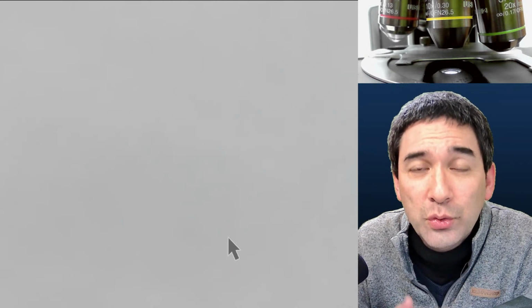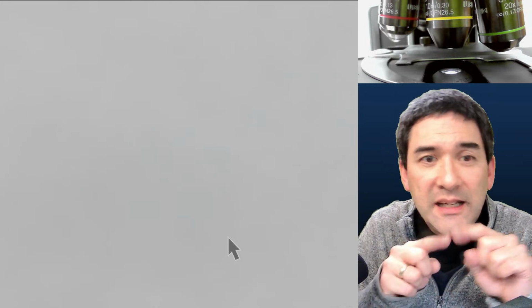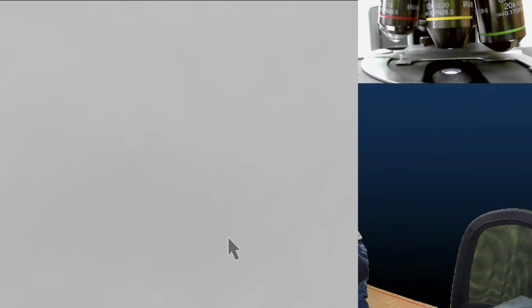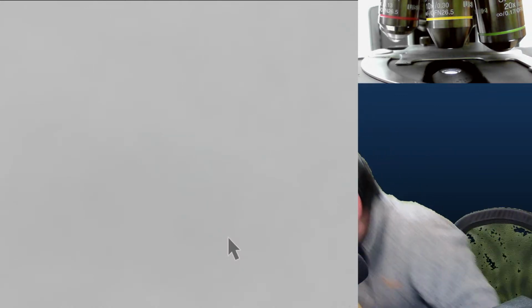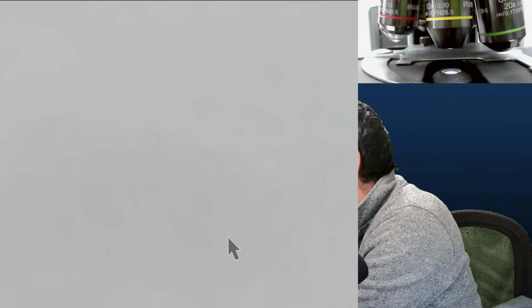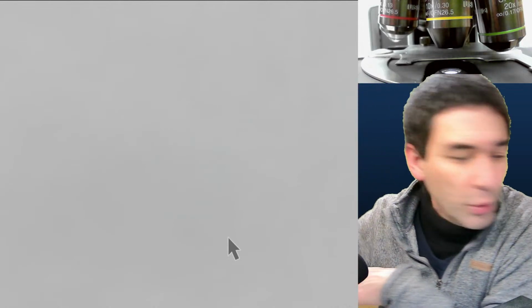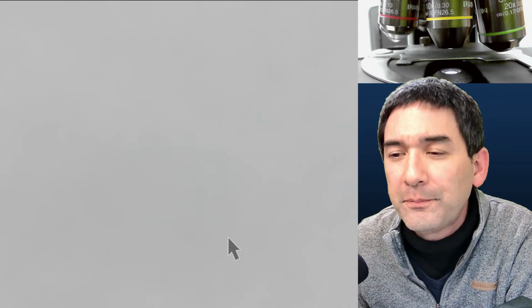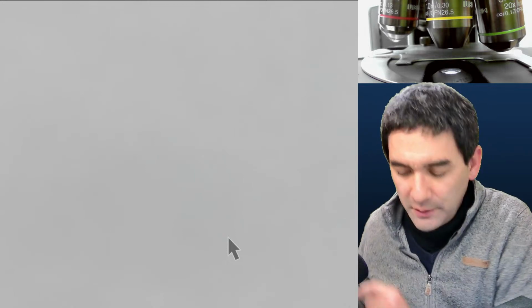In this case, I do recommend that you get those slides that have an indentation. Let me quickly check, give me a second. I don't have them here now. I don't know where I put them. But there are slides which have a so-called concave indentation, otherwise there's a little bit of danger that the cover glass is going to crush them. Yeah. So let's move on.